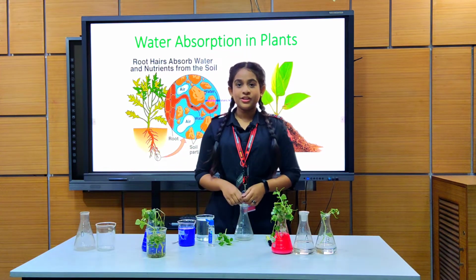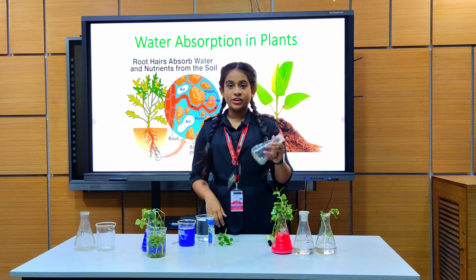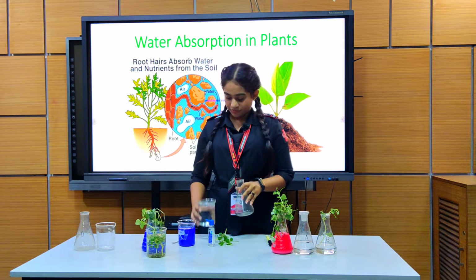Hello, I'm Ogni. Now I'm going to be showing part C. First we have a conical flask here. Now I'm going to fill it with 3/4 of water.